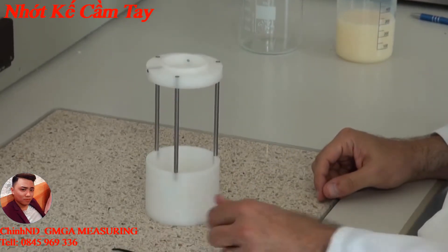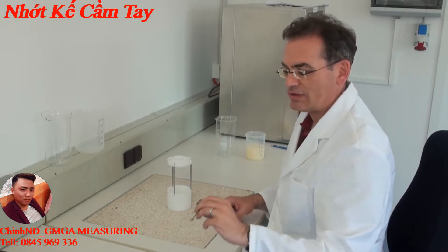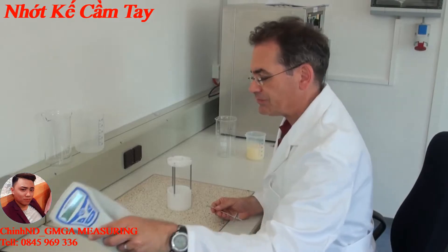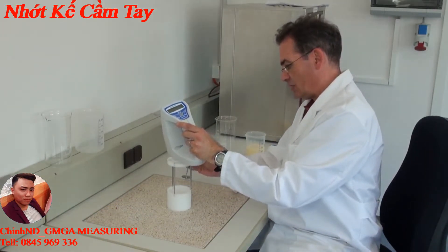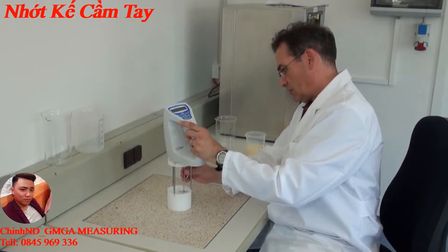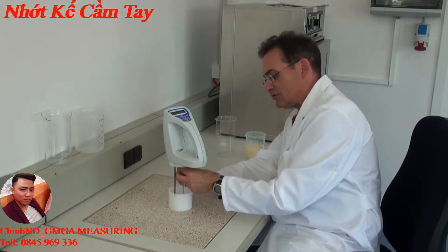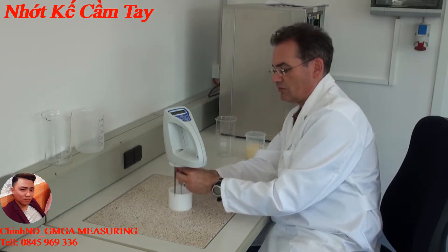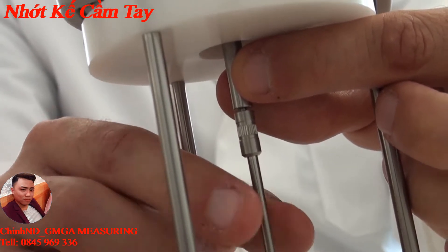Now the protection cage is built up properly. Depending on what viscosity I want to measure, I choose a corresponding rotation body. I take the viscosity meter, put it onto the mount, and fix the rotation body from underneath by screwing it to the rotation part — turning the rotation body counter-clockwise.